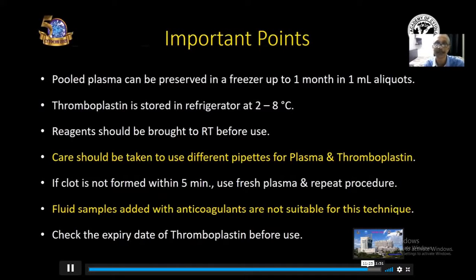Fluid samples added with anticoagulants are not suitable for this technique. Check the expiry date of the thromboplastin before use.